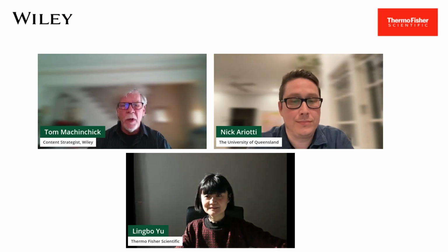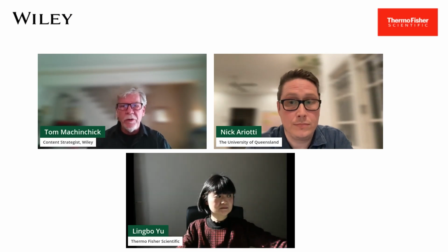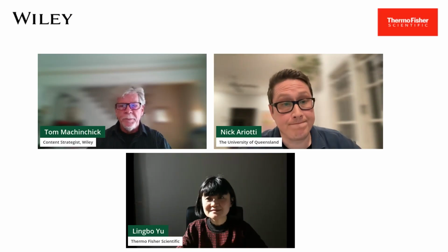We do have a bunch of questions from the audience, and I'd like to get started with the first one. This one is for Dr. Ariotti. Have you modeled your ASK complex using AlphaFold, and what did you see?